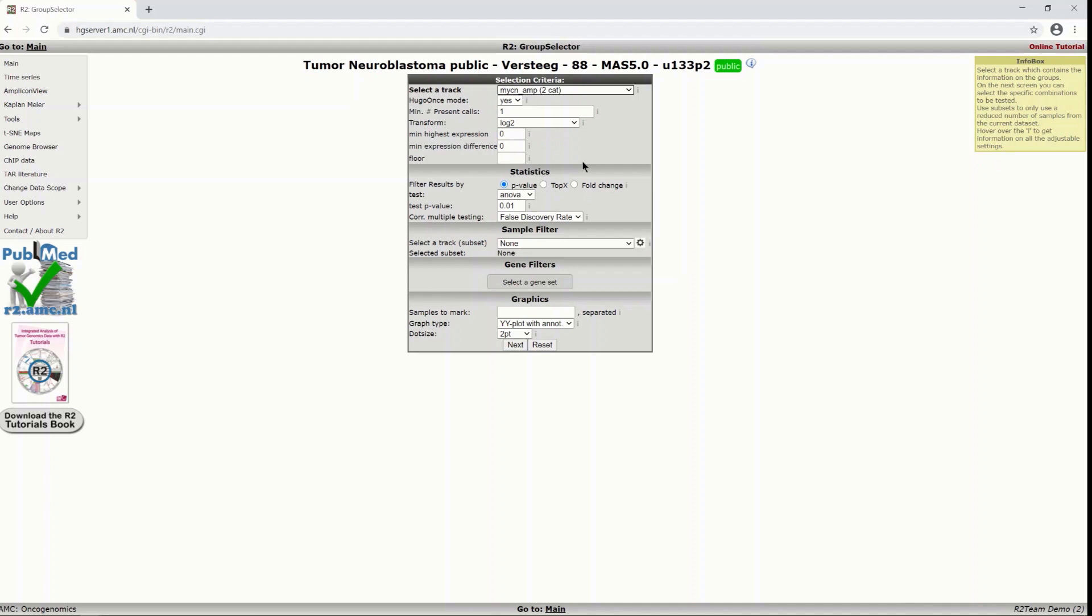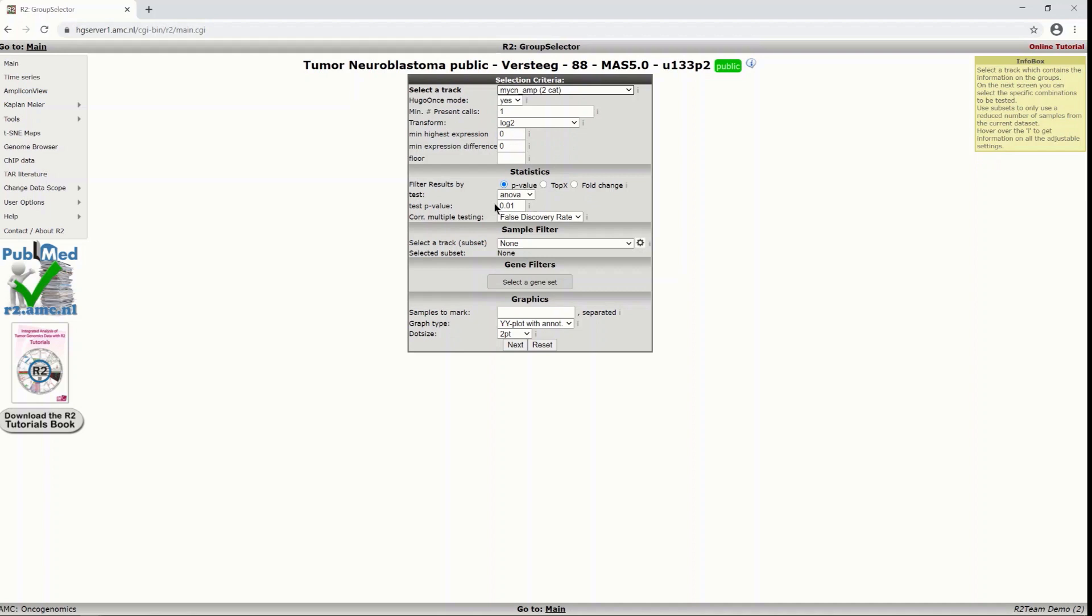Now you have here some other statistics that might look quite intimidating but let's have a quick closer look. You can see that by default the p-value is selected and for which we use the ANOVA test and where a threshold of 0.01 is set that's to say that we want to find genes that are differentially expressed between our groups with a significance of 0.01 or smaller.